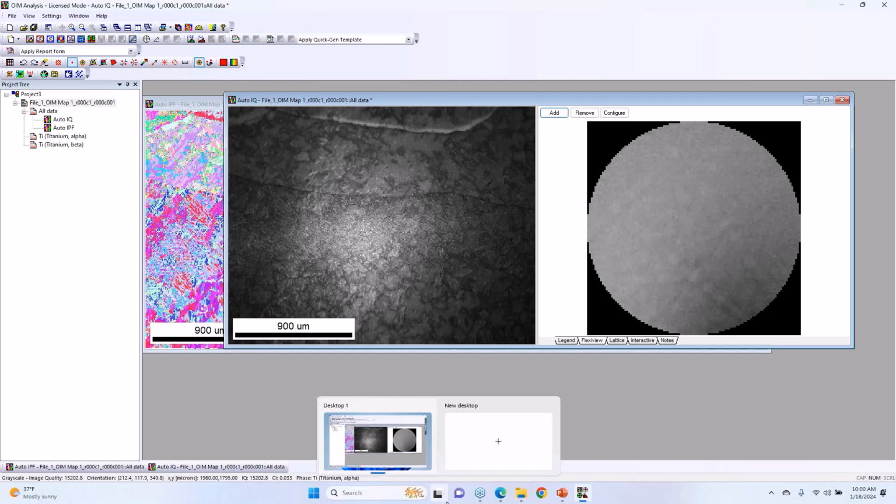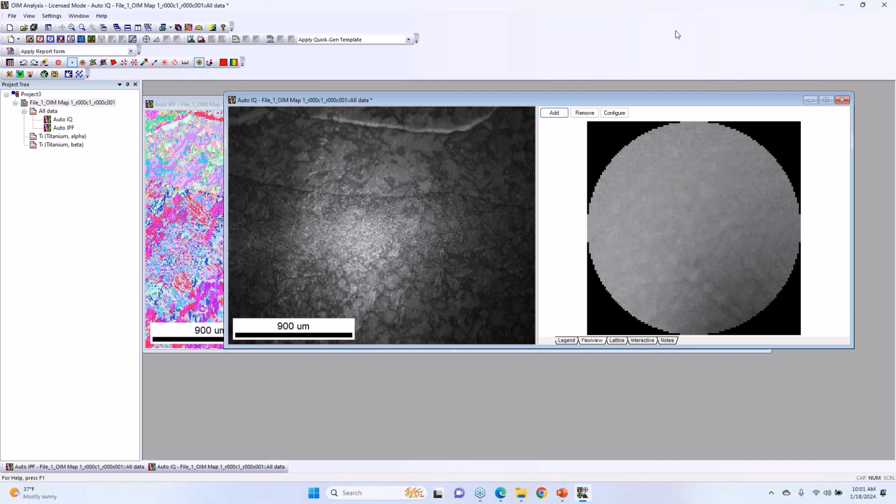You can certainly go in the software and look at every field and get it to line up as best as you can. If you're looking at 4 fields, it's easy to do manually. If you're looking at 400 fields, you get bored after about 4 fields. So having that automatic alignment is nice, and having that overlap to do the final matching is nice. I don't know if that answered your question, but hopefully.